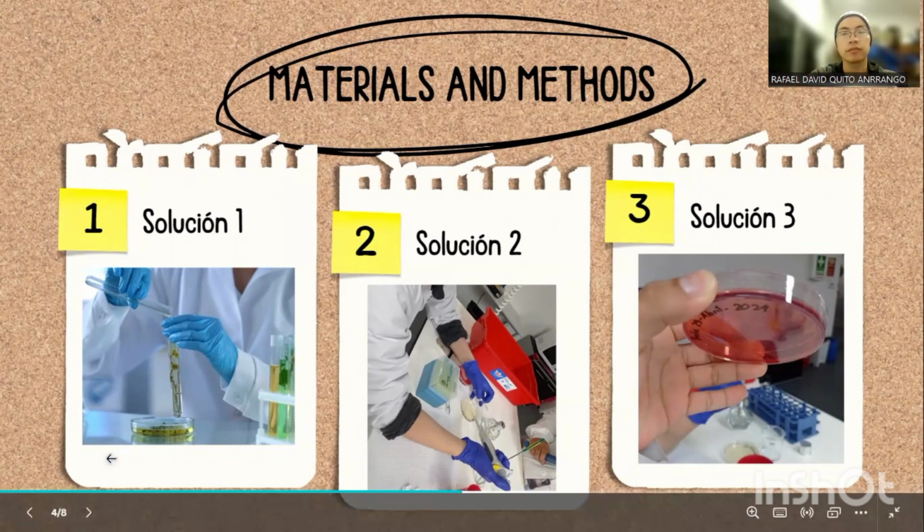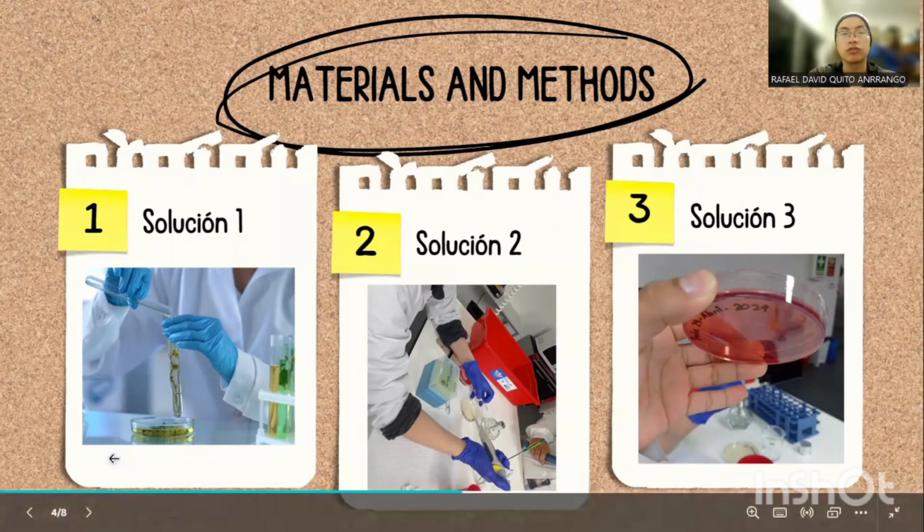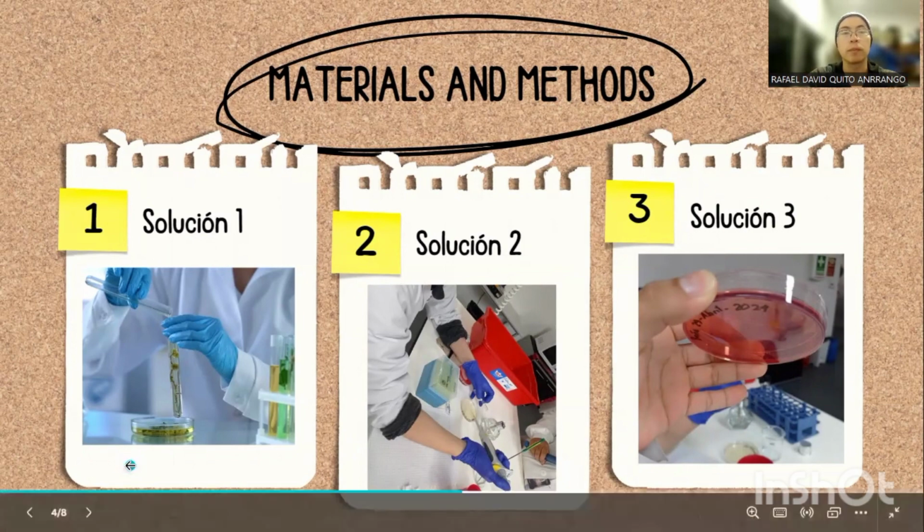Sampling. 1. Surface selection. Choose at least 2 different types of surfaces in the processing plant to sample, such as work tables, door handles, and equipment.